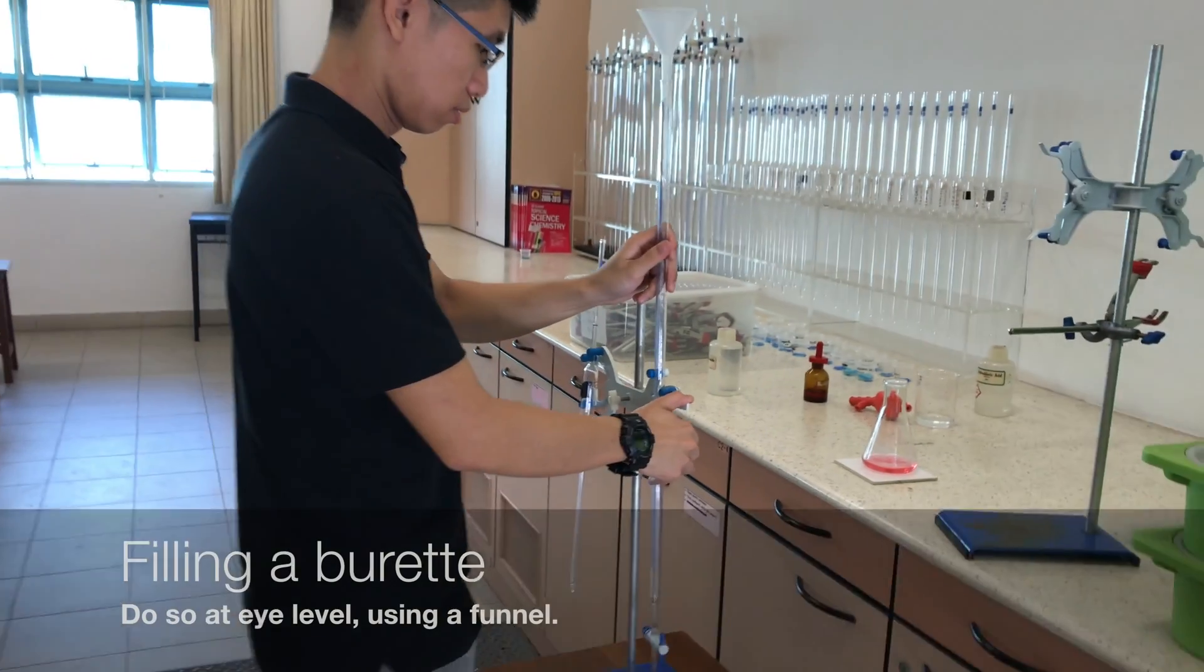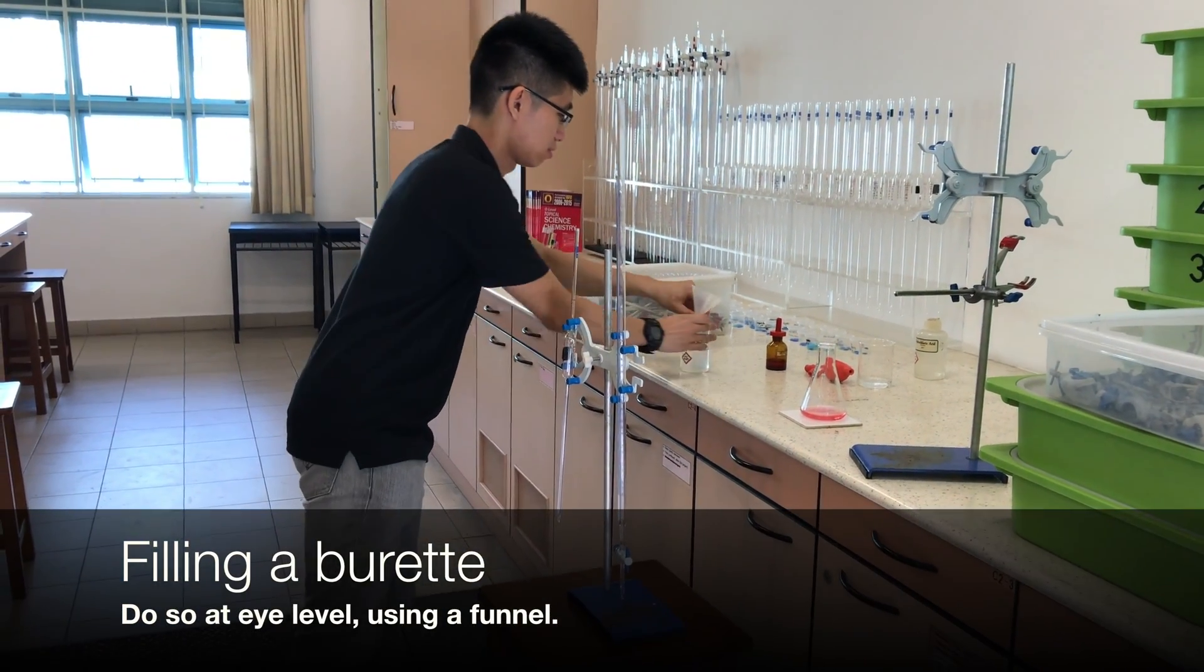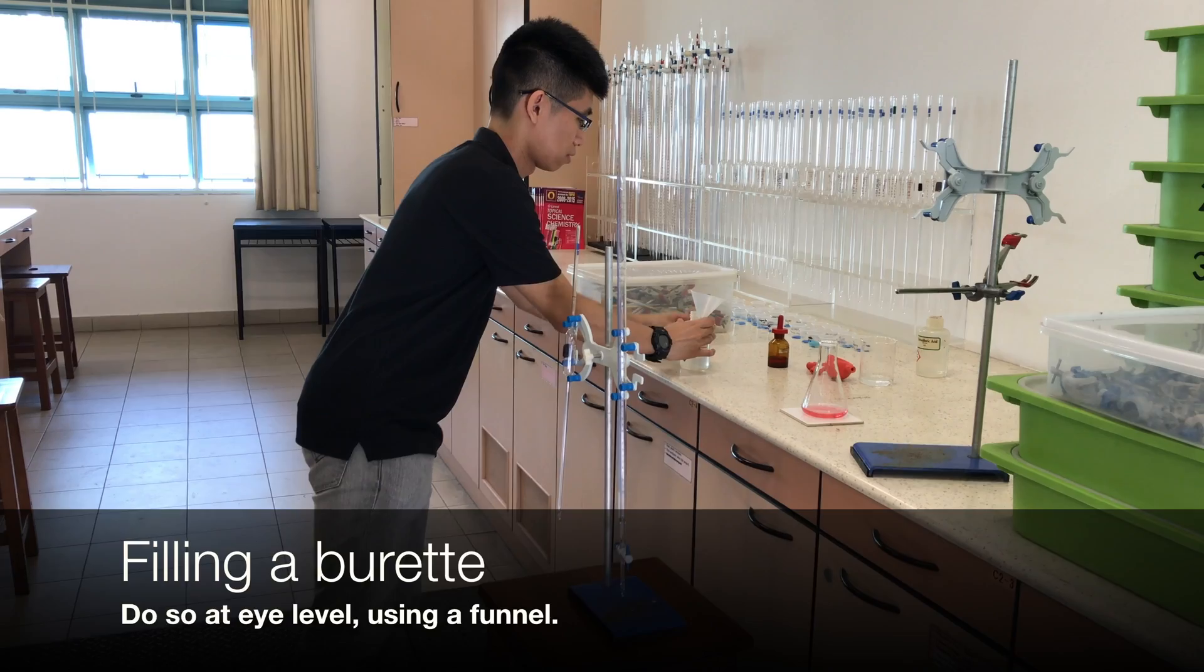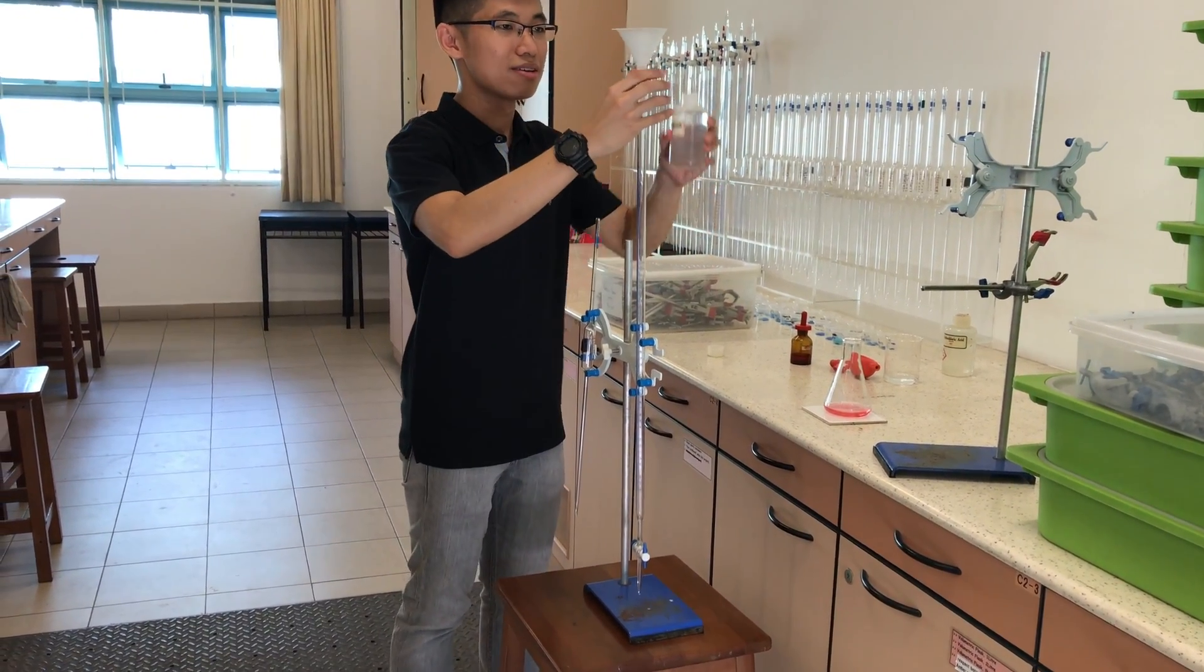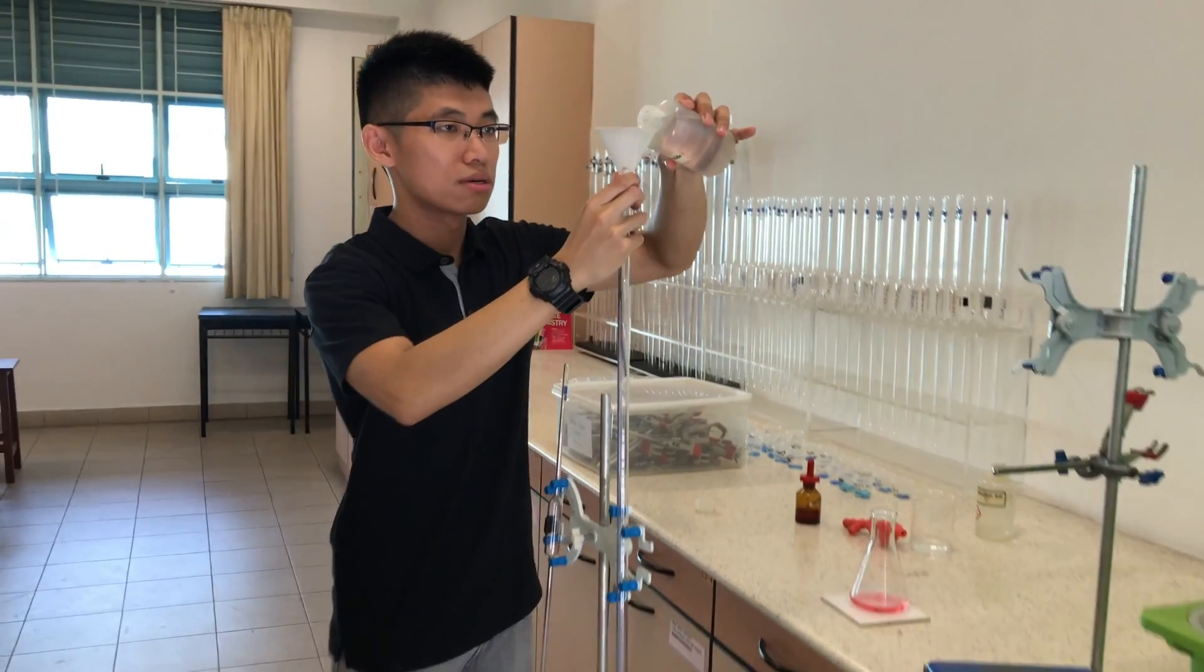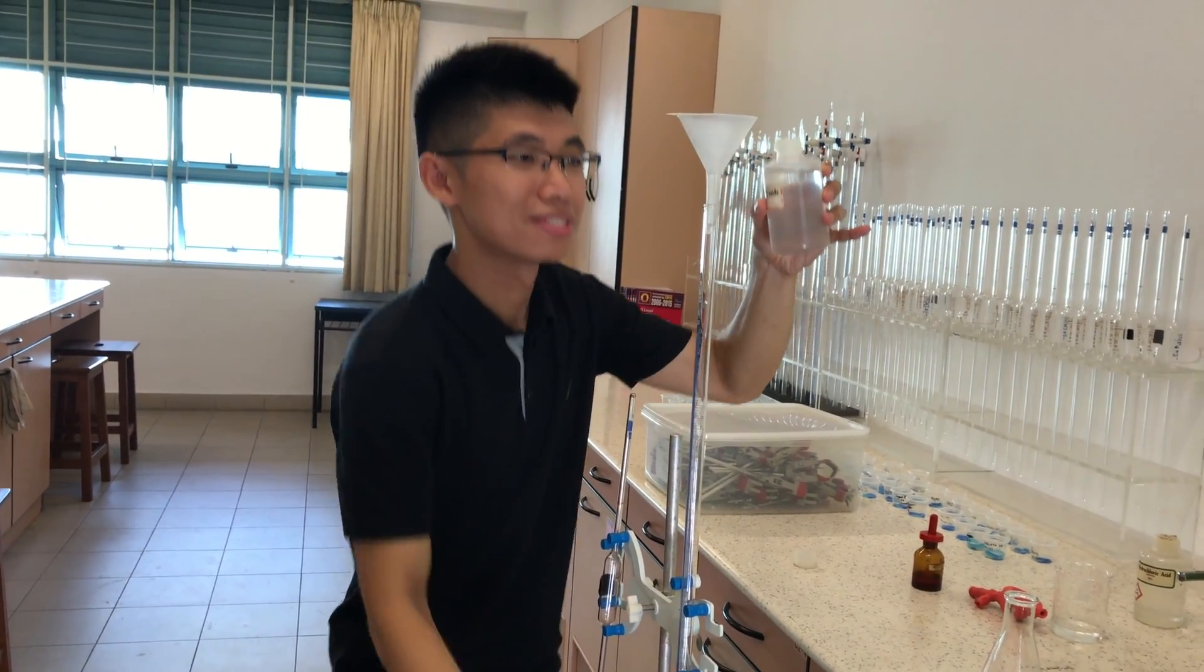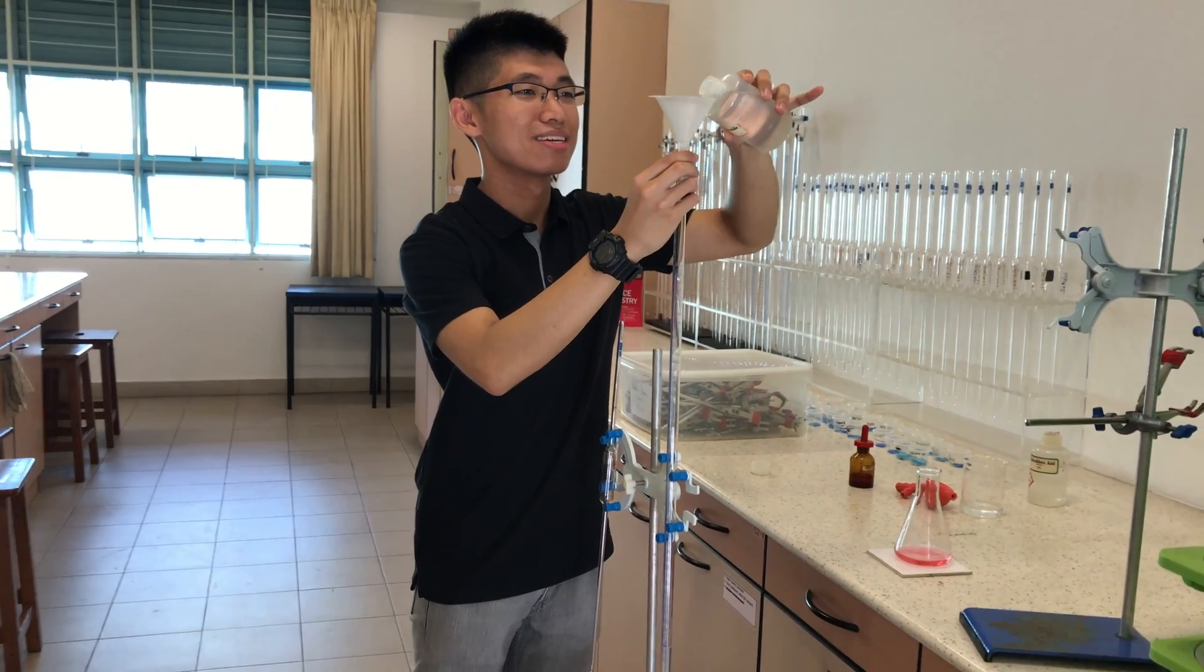We now move on to filling up the burette. We will place the whole retort stand onto a bench so that we can fill the burette at high level. Place a filter funnel at the top and gently pour in the reagent into the filter funnel, ensuring that the tap is closed.